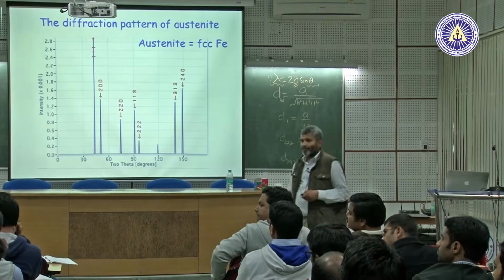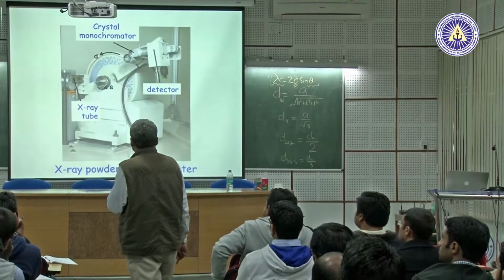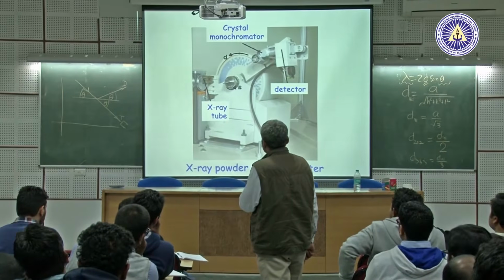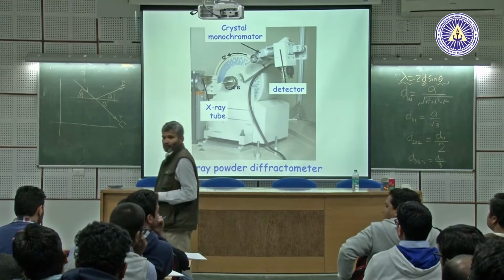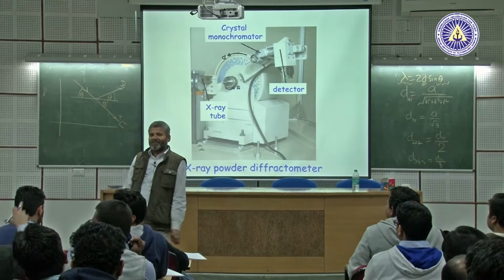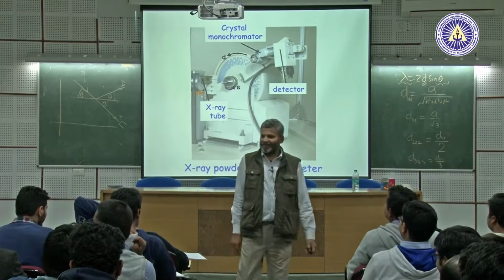Where will we sense the reflected beam in this diffractometer? In the same detector. The detector is detecting only the reflected beam. Deflected or reflected? Nobel Prize of Bragg. Transmitted deflected?